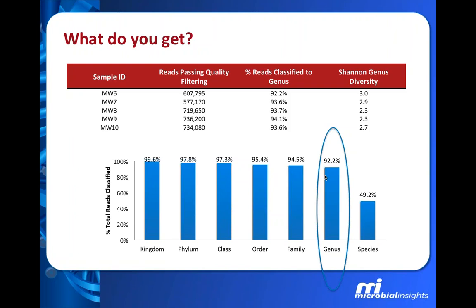Another important tool that you'll find in that table above, which we'll mention a couple times today, is called the Shannon Diversity Index. You can research and get more information about this, but it's a good tool for us to use comparatively to help us understand diversity differences between each of our samples.